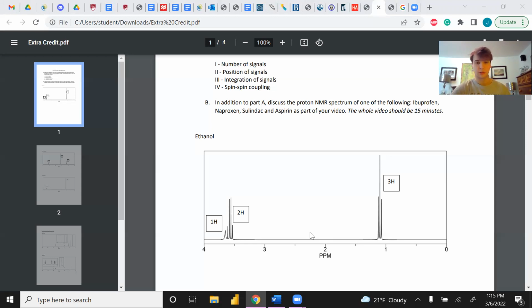For example, if we were looking at the CH2 group over here, or the OH group compared to the CH2 group, we would say, oh, the OH group is next to a very electronegative, sorry, the hydrogen is really next to an electronegative oxygen, right? And the oxygen is pulling those electrons away from that hydrogen, meaning that when the wave hits it, it's going to have much more of an impact and it's going to shoot down the spectrum, downfield, that is. And this is how you determine what's next to what, but we'll get into that in just a second.